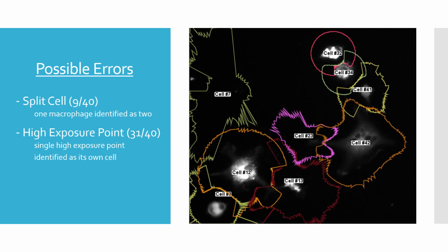The overlay shown here was also generated by the automatic program. It shows 9 macrophages identified, even though through our ground truth analysis, this video was determined to only have 6 macrophages that remain throughout the image's entirety.